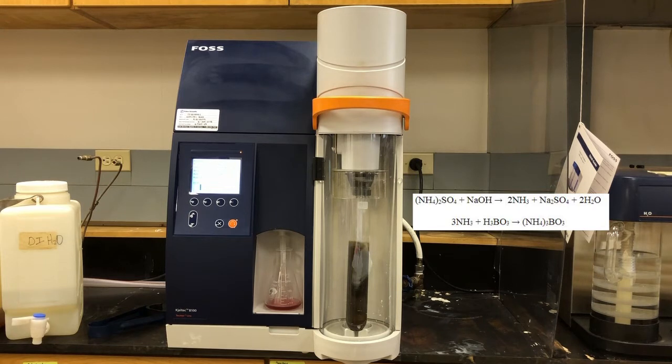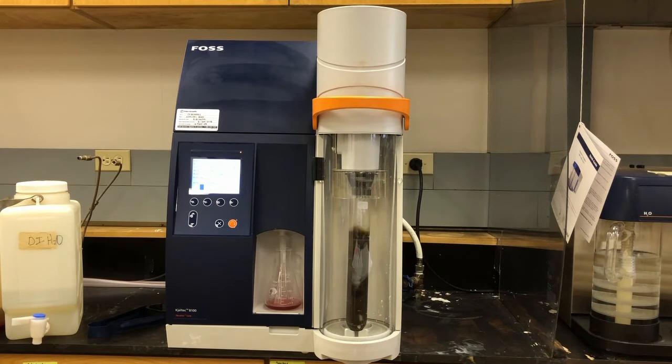And once all the alkali is in, the steam distillation starts. So you can see the bubbles being produced there in the tube. So that's being pumped into the sample tube through the steam tube. And that will run now for about 5 to 7 minutes until all of our ammonia is collected in the receiving flask.